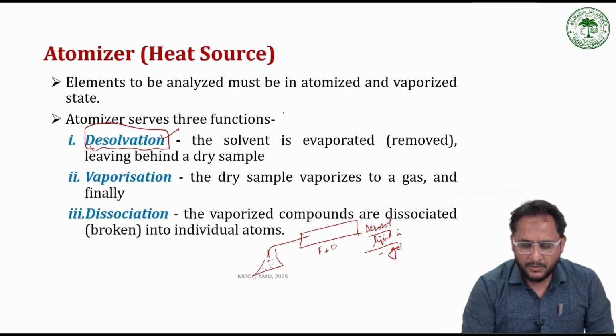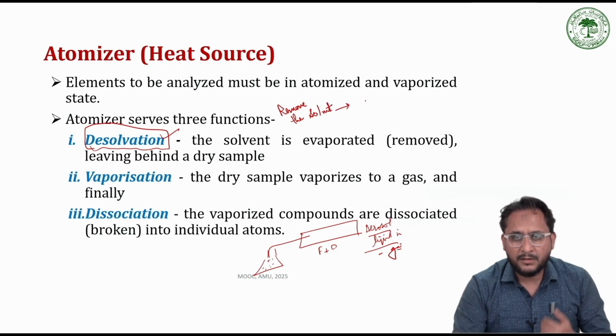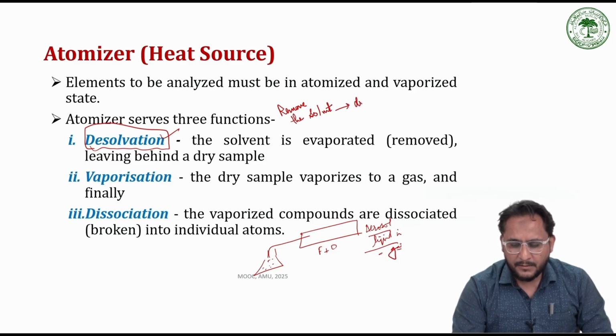Once the solvent is removed, the sample is obtained in dry form.